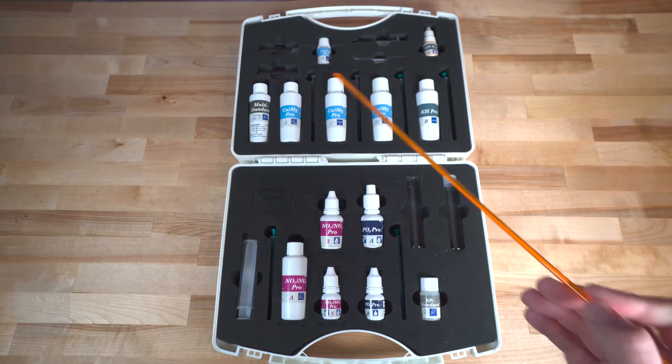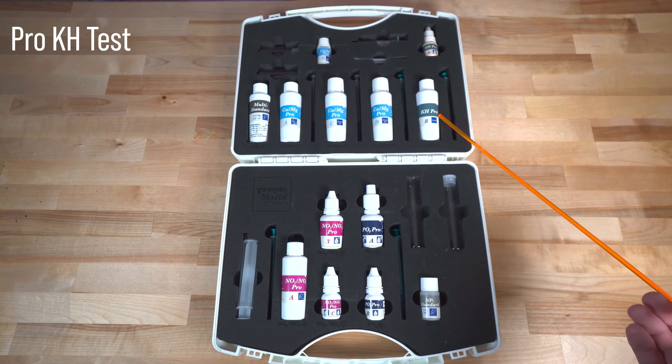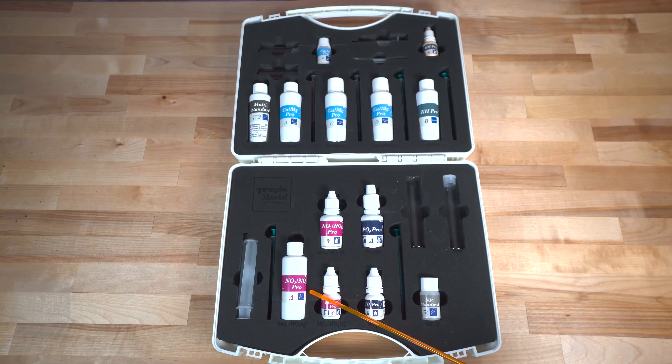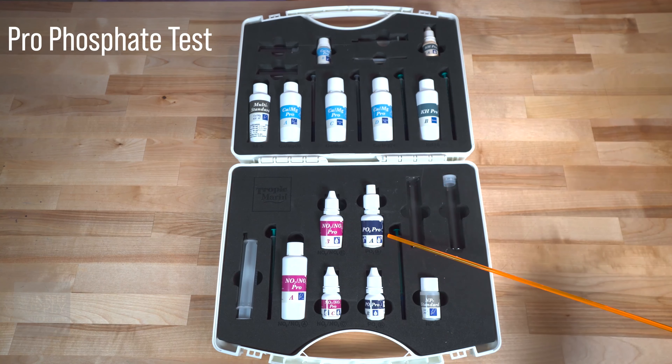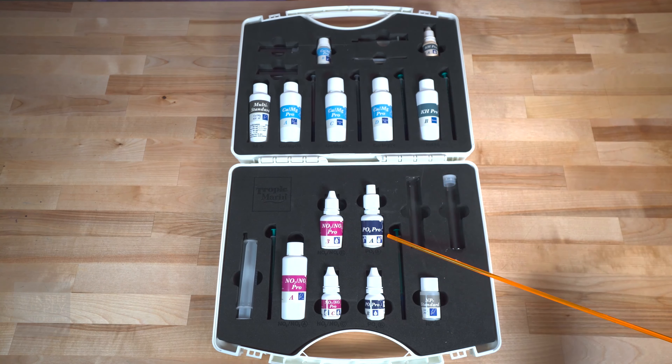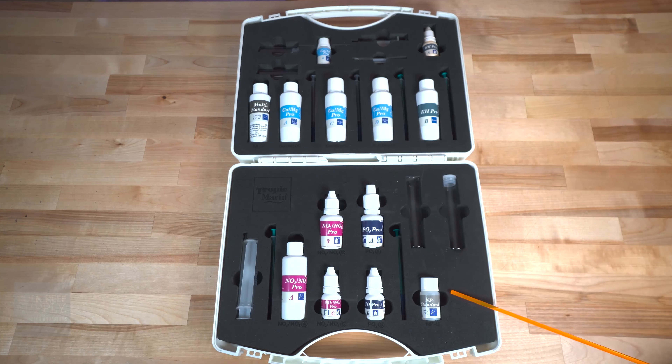Let's take a look inside. Inside the kit you'll find a pro-calcium/magnesium test, the pro-KH alkalinity test, the pro-nitrite and nitrate test, and the pro-phosphate test. You'll also get the multi-standard solution and the NP standard solution as well.